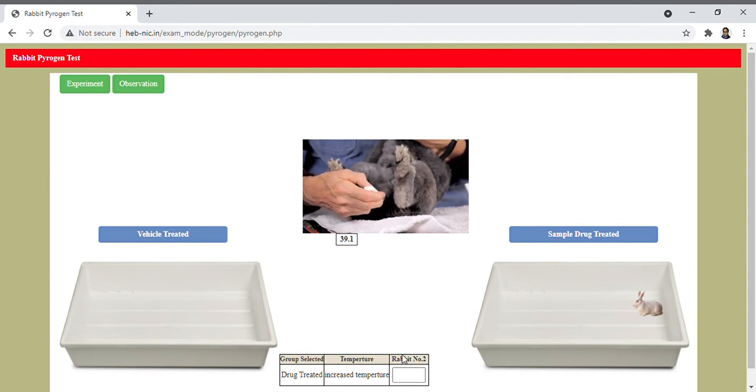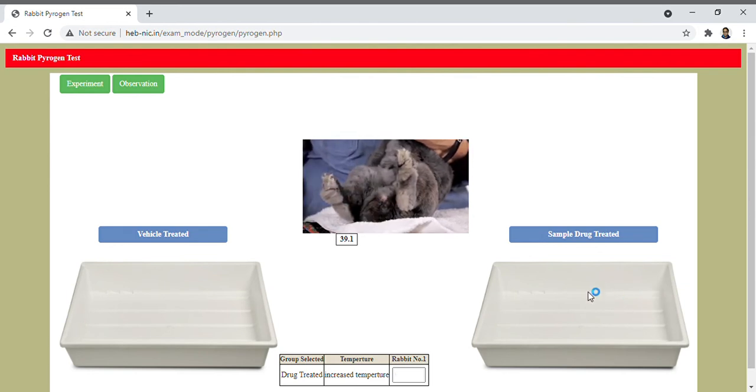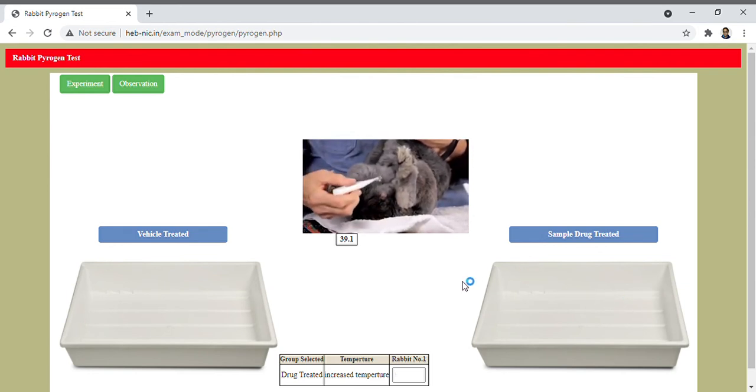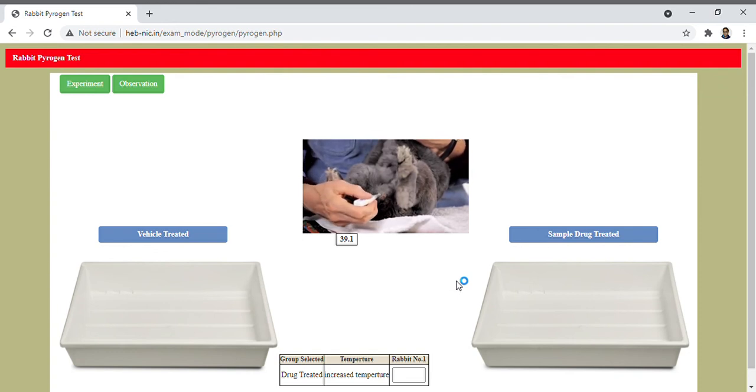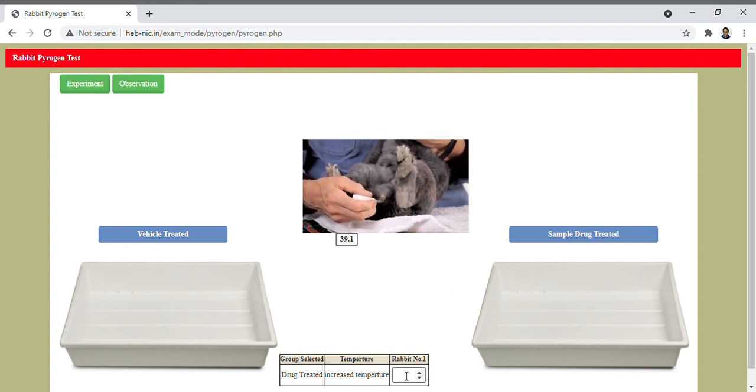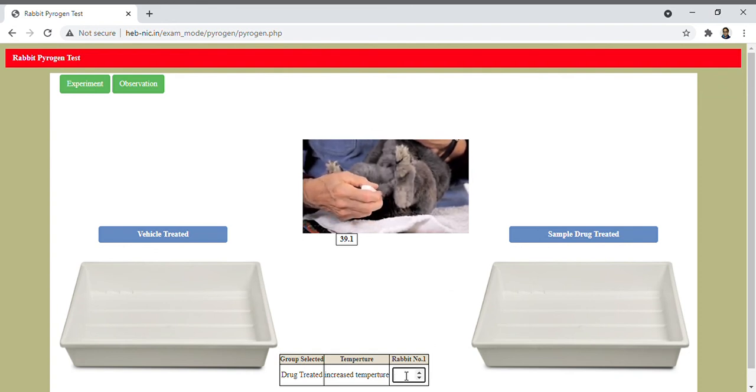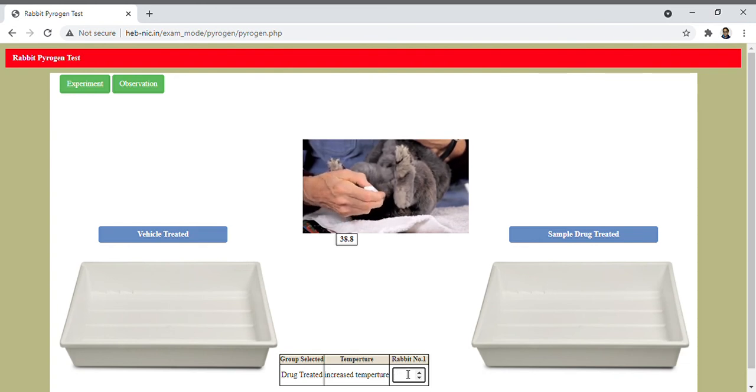And it is 39.6. Now select the last third rabbit and record the rectal temperature, and it is 38.73.